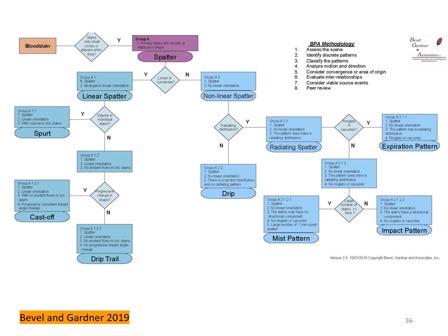So many of you know the textbook of Bevel and Gardner, and they have a decision map where you go along a decision tree and you have to answer questions by yes or no. And my claim is that some of these questions might be assisted by this tool, so that you can get an answer that is more quantitative, and that people will agree on, because sometimes it's hard when you have several people to agree on questions like this.